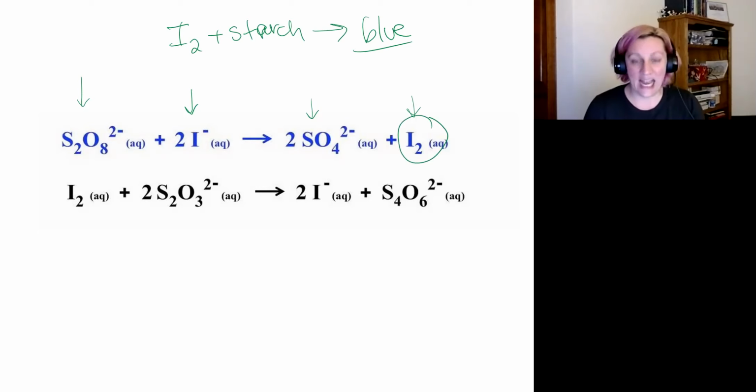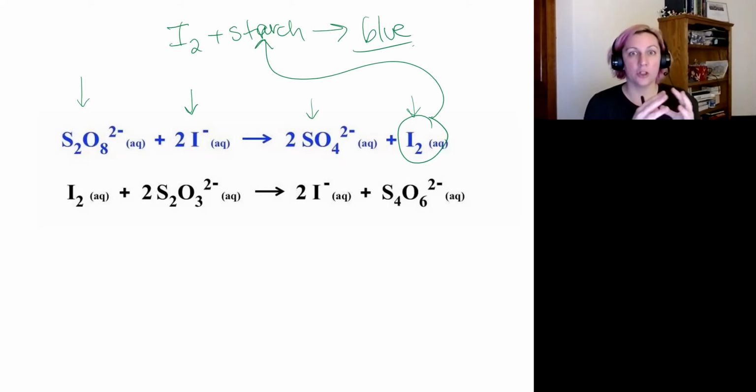So once the iodine is created, it reacts with the starch and the solution turns blue. So this means when we combined everything together, we would instantly see blue. And that's not going to help us compare concentration to an amount of time and develop a rate from that, just visually with simple tools like a stopwatch.